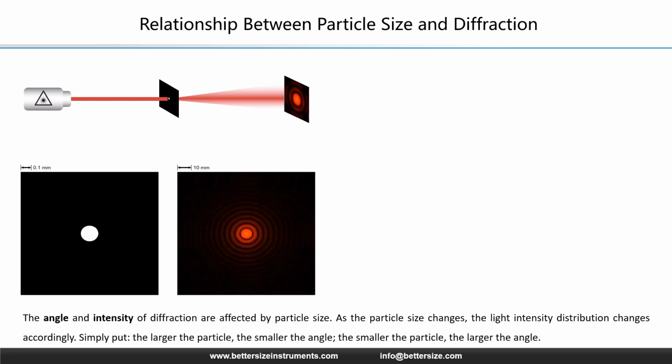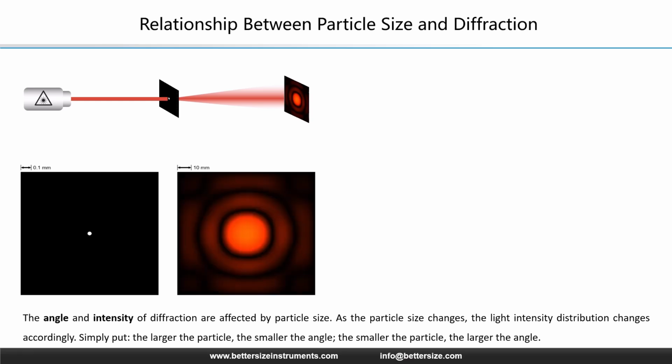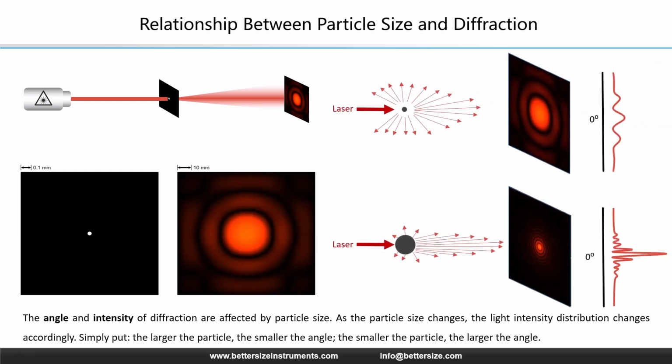As the particle changes size, the pattern breathes. You will notice a fundamental counterintuitive behavior. As the particle gets smaller, the pattern gets bigger. As the particle gets larger, the pattern gets smaller. This is the inverse relationship that drives our entire industry. Let's freeze that motion to make it clear.